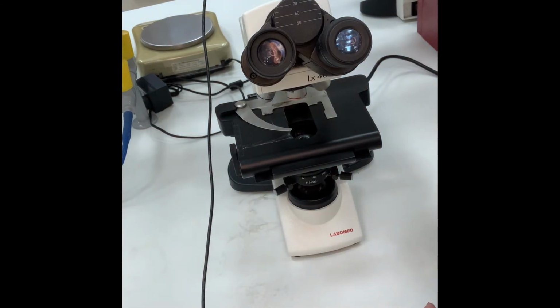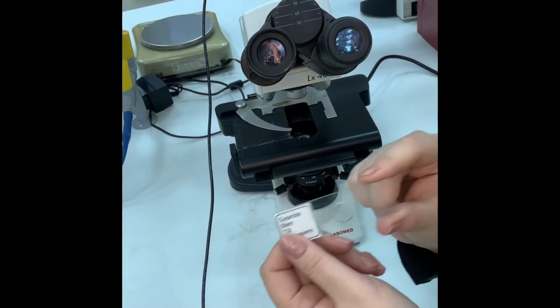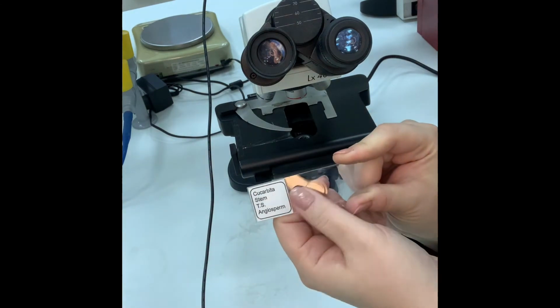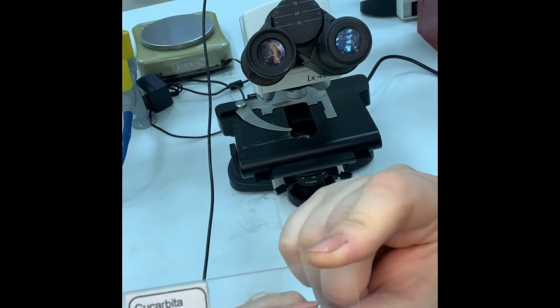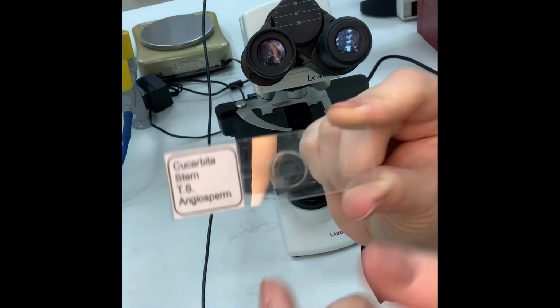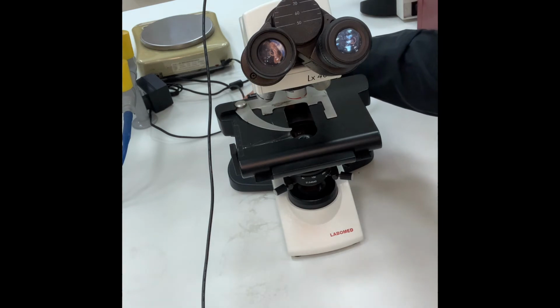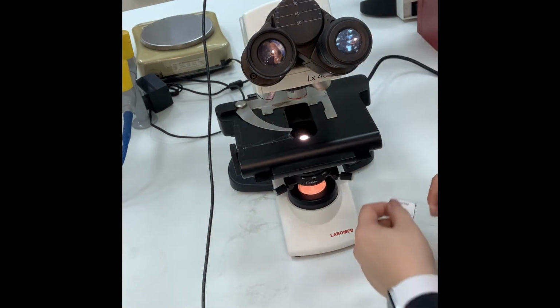Now, for the procedure, how to use the microscope, it is very simple. This is the microscopic slide. This is fixed, this is permanent, and this is where we have over here the sample itself under the cover slip. All I have to do is sit and face the microscope.